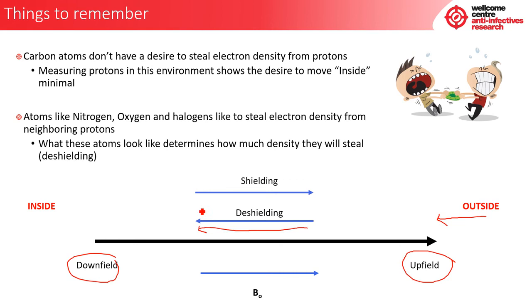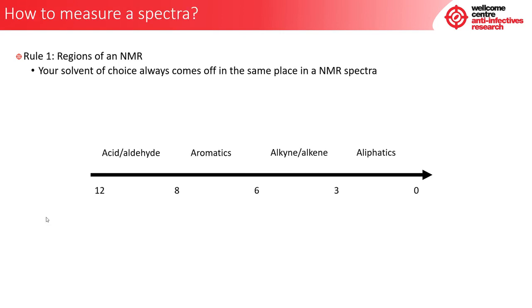And this seems to be quite a weird technique to explain, but over the years of teaching this, I found this to be quite effective for teaching people who are not chemistry related, to get them to think about the inside and outside of your spectra. So, rule number one, let's start with the rules. It's all about the rules.